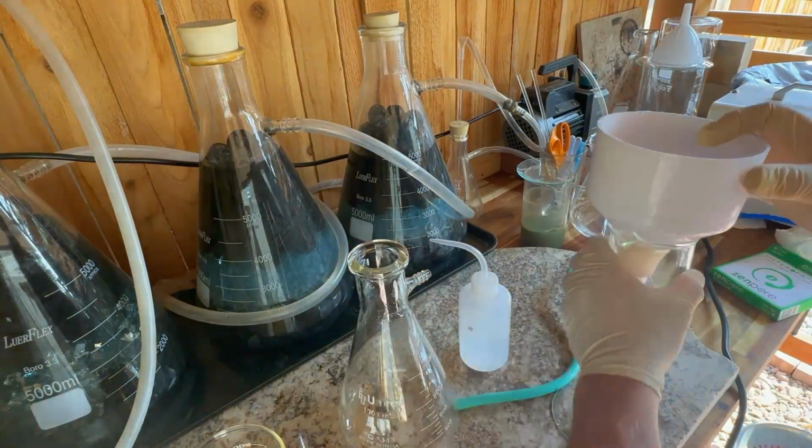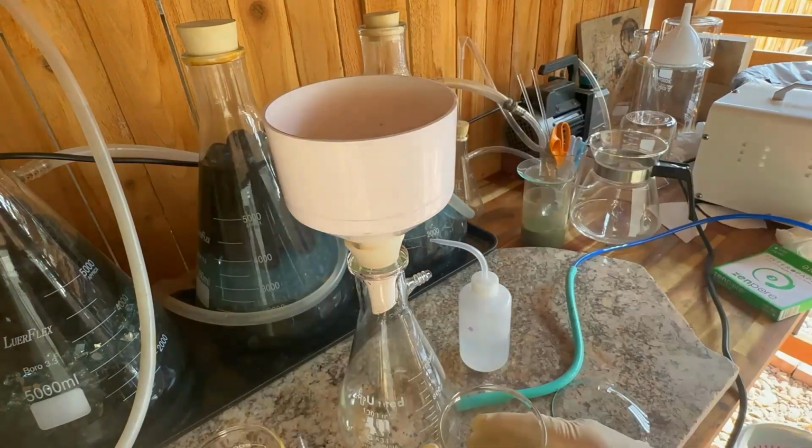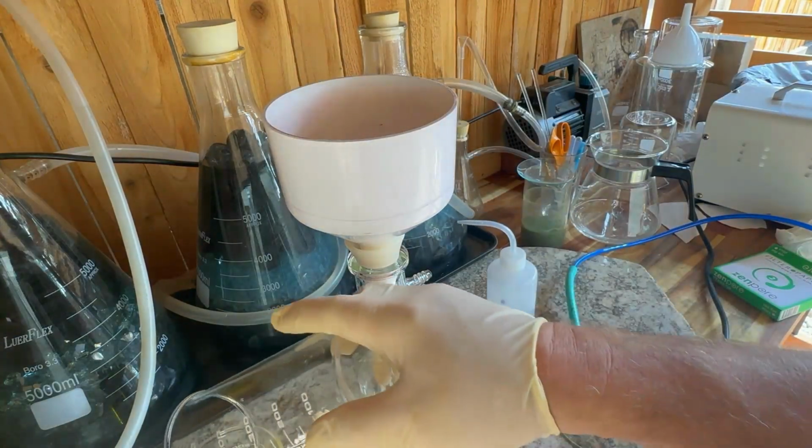So we'll get set up here. We're going to go back through the same filter. It's got all that gunk in it, so it's going to be much tighter filter this time around.